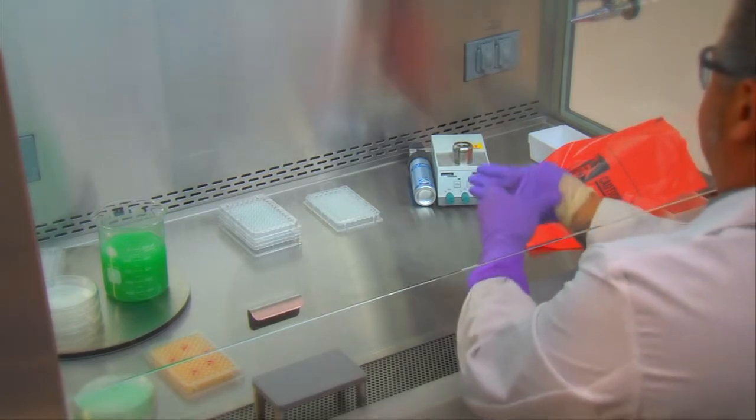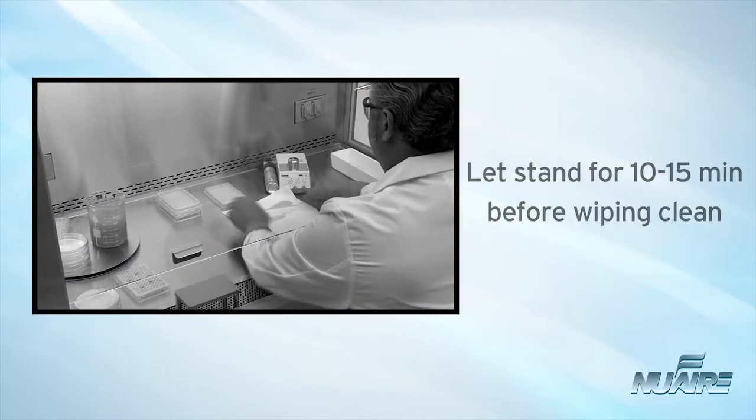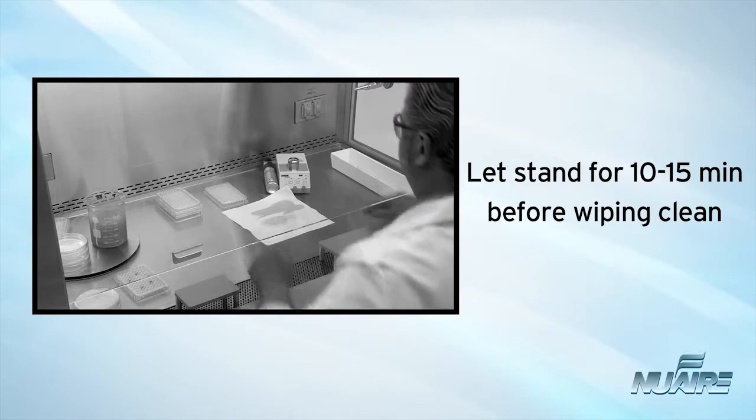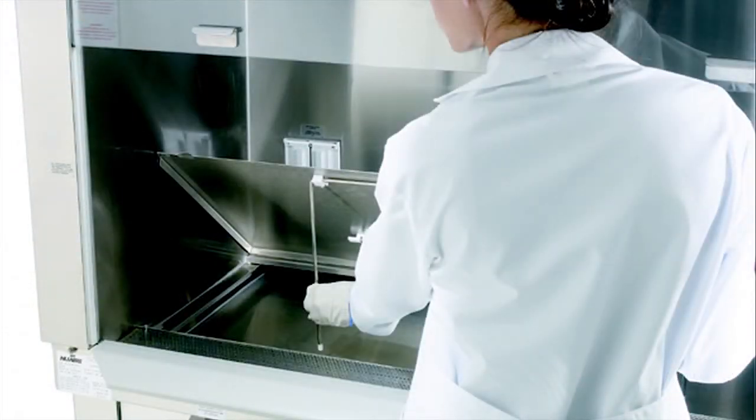Make sure to wear gloves while doing this. If the spill is large, flood the work surface with disinfectant and allow to stand 10 to 15 minutes before absorbing and wiping clean. Be sure to check the spill pan under the work surface and disinfect as well.